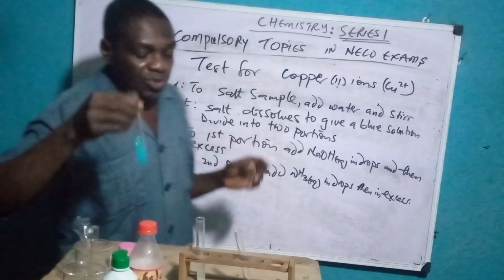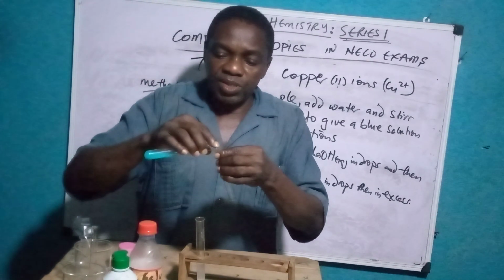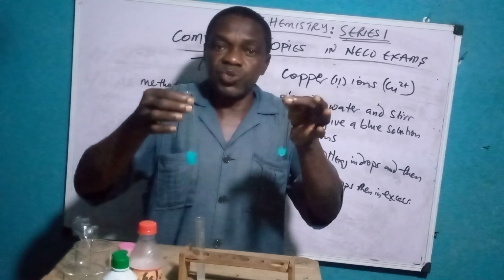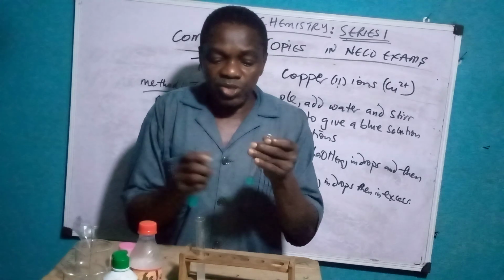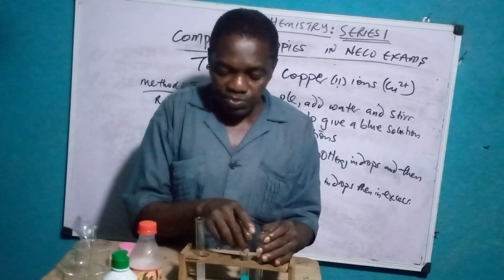The next one, divide into 2 portions. So let's share it into 2. Make sure the quantity is reasonable, it's not too much. So you see we have shared into 2. This is for the purpose of practice. In exam condition, you make sure the quantity is half of this. So we share it into 2.